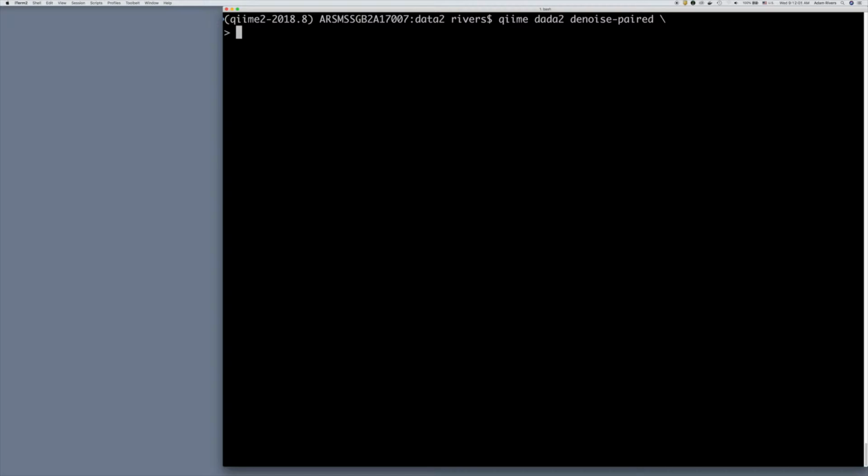So we'll use the command qiime dada2 denoise-paired. For input, we'll use the trimmed read pair sequences that ITS Express generated in the last step. The next settings determine the trim length of the 3' ends for both the forward and the reverse reads. We're going to set those to 0 because our quality scores are pretty high, but you should always check your quality output plots at the beginning and make sure that, if you have low regions, you trim the ends off of them. That's supposed to help with DADA2 clustering or sequence variant calling.